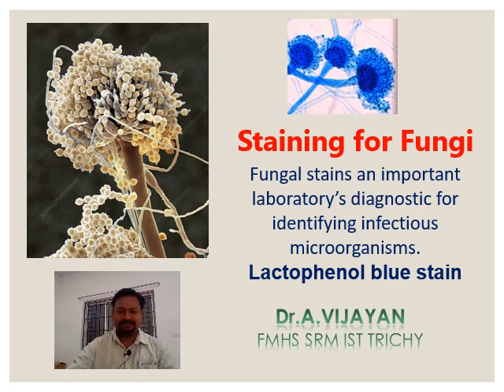One of the stains is lactophenol cotton blue. Lactophenol cotton blue can be used to stain the fungal cell walls. It is a wet mounting medium and staining solution used to prepare microscopic slides of fungus for further studies, and fungal components appear bright blue in color.